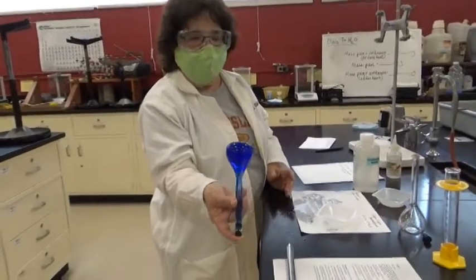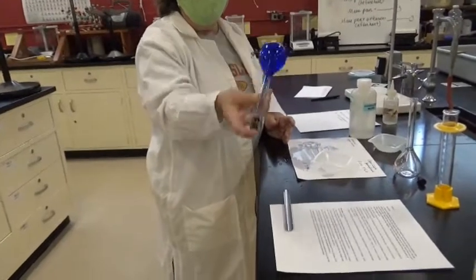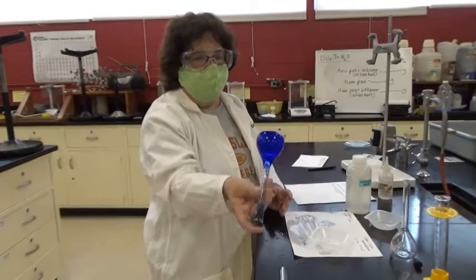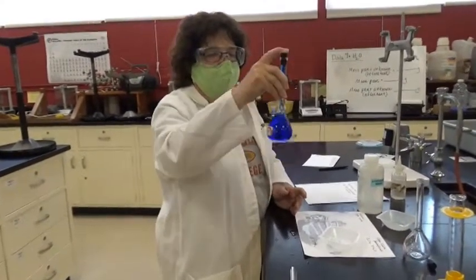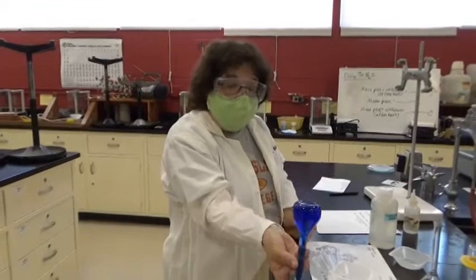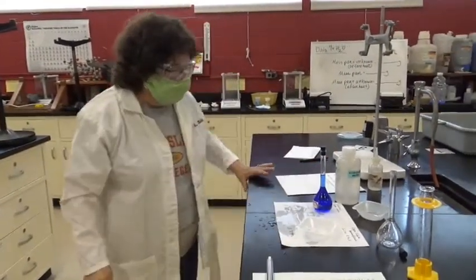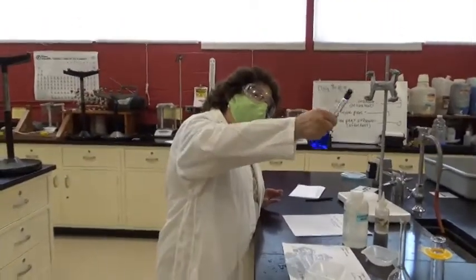I see a little bit of the solid on the bottom, so I want everything to be dissolved. Again, if you see solid and you're trying to make a solution, that solid that's not dissolved is not going to react. We're going to let it sit a while. Okay, I'm going to let it sit now. There was a little bit of solid here, and it is dissolving, so we're doing okay.